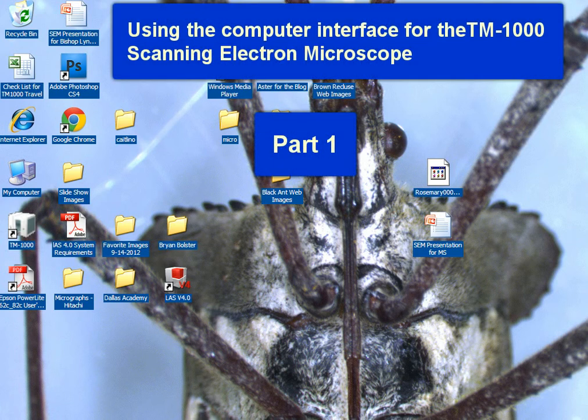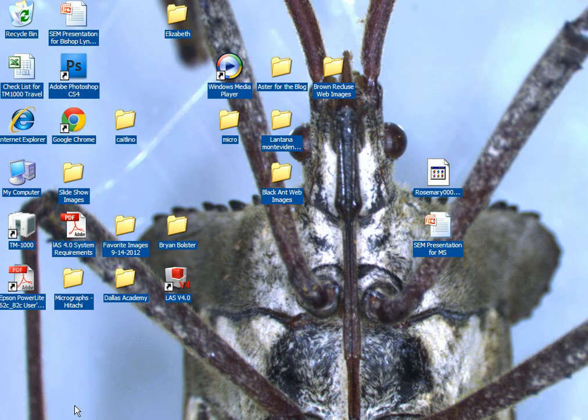We've got our specimen in the chamber. Let's go ahead and start the vacuum. I'm going to hold the drawer close and hit the exchange button. You'll hear in the background that little red vacuum pump starting to pull air out of the chamber. That's our first vacuum.